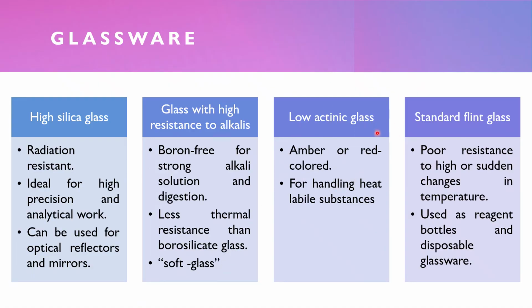There's also low actinic glass. Low actinic glass are amber or red colored bottle glasses. They're used for handling heat labile substances. You call them low actinic glass.